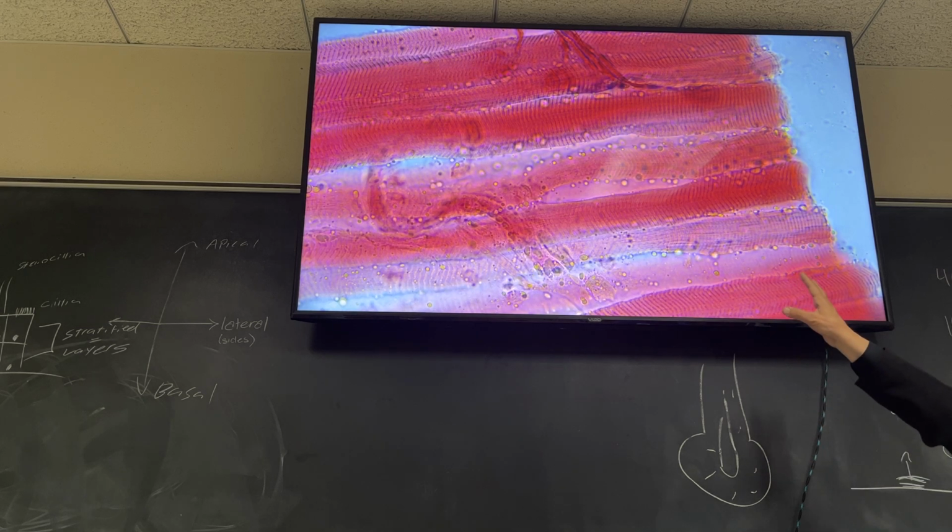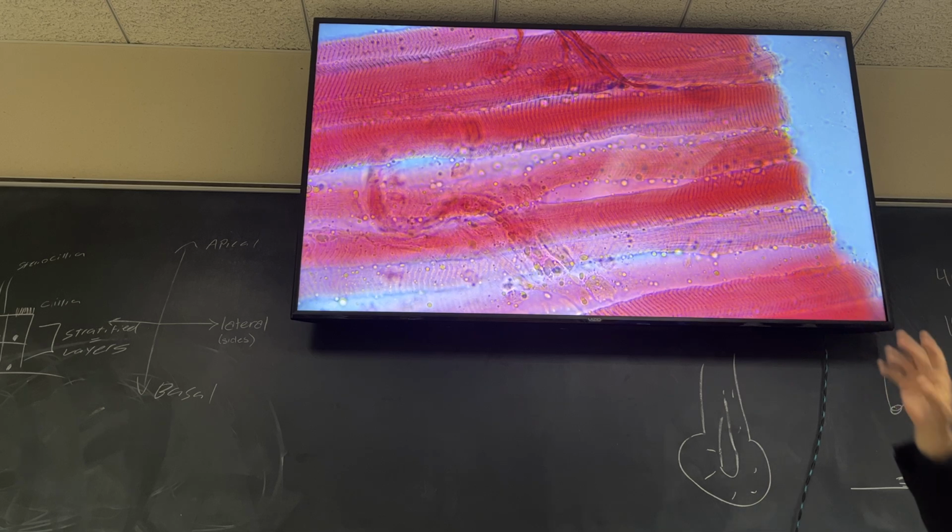And almost all these slides, by the way, are taken from that same piece of tissue, that same organ, if you will. And where do you have the highest number of motor end plates? Tongue. Talking, right? You use it to talk all the time. Mouth as well, large numbers in the mouth, but the tongue probably has more than any other. Vocal cords have a reasonable amount, although even though you use them to talk, it's just a matter of tightening or loosening them a little bit, giving you a tone more than anything else.